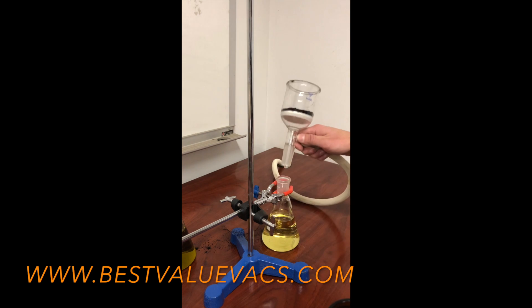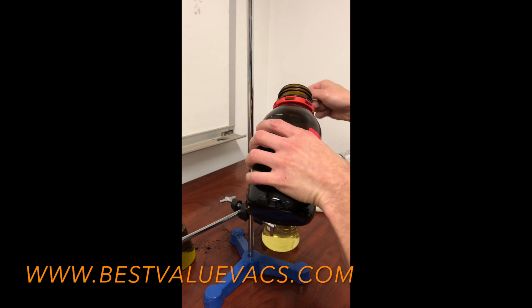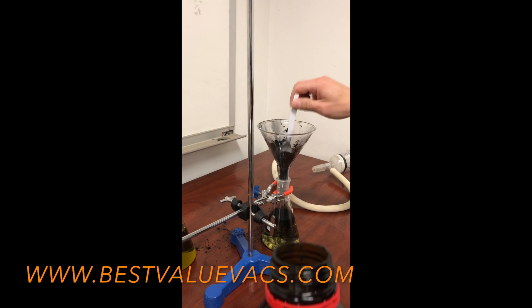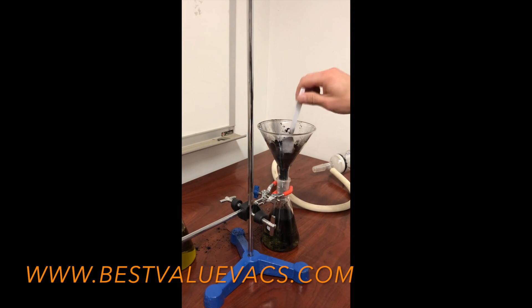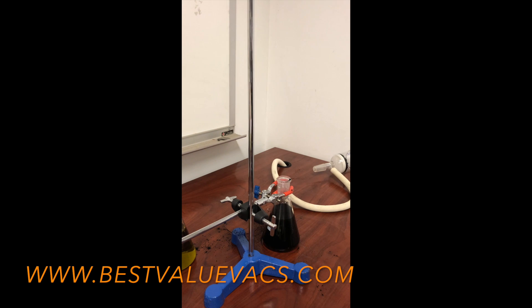Another trick you can do is add carbon directly to the fluid itself. I'm adding two scoops of carbon directly to the fluid and stirring it up well to mix it in thoroughly.